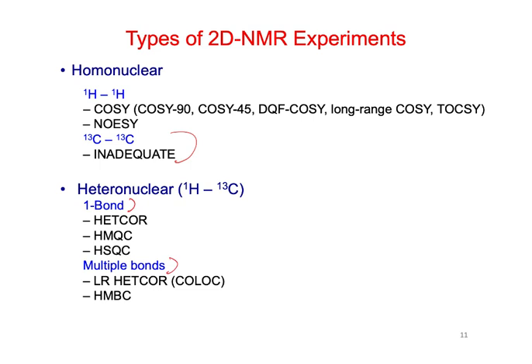So we're going to look at the one bond couplings first. What I kind of introduced before is this HETCOR, or heteronuclear correlation experiment, which was the first one that came out, and this was what we call C13 detected. We essentially pulsed on the protons in the beginning and detected on the C13s.